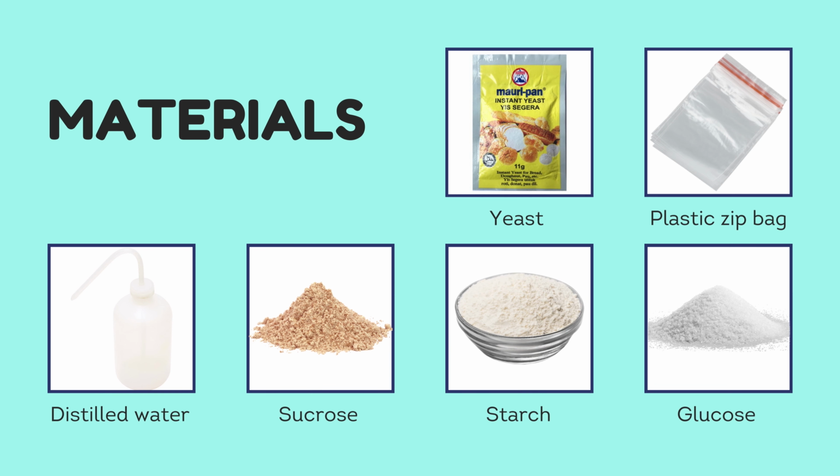The materials used in this experiment are 4 plastic zip bags, yeast, glucose, sucrose, starch, and distilled water.